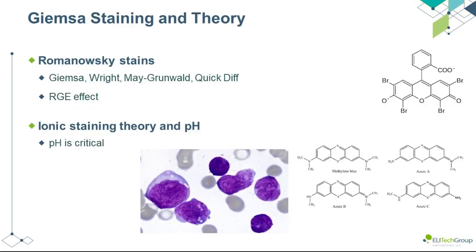I want to pivot here and talk a little bit about staining and stain theory. Understanding how staining works can also help us avoid artifacts and pitfalls associated with the staining process. So when staining blood and bone marrow, we are usually using a Romanowsky stain, which can be considered a group of stains that utilizes a blue stain, usually methylene blue and azures, in conjunction with a red stain, usually eosin. There also might be some amount of buffer for washing and diluting involved.